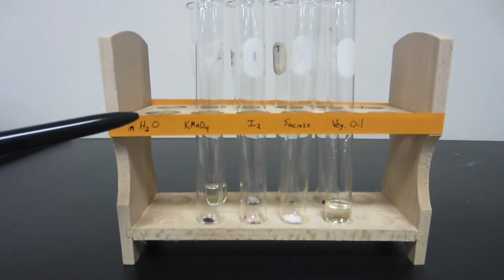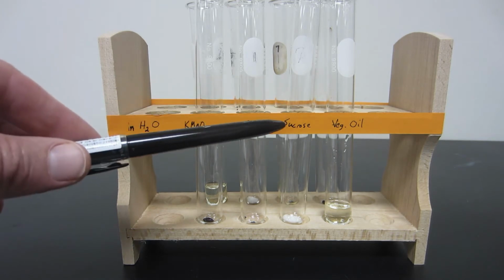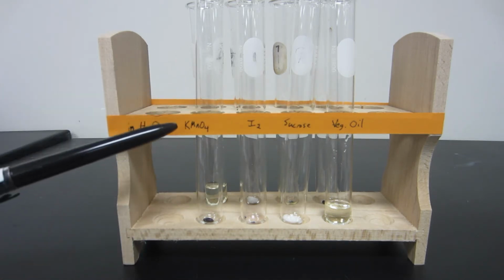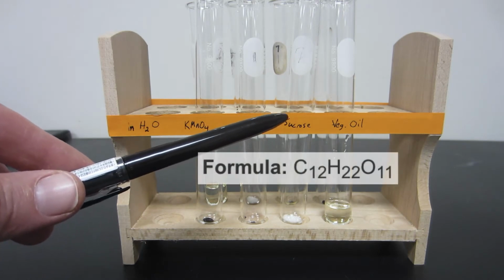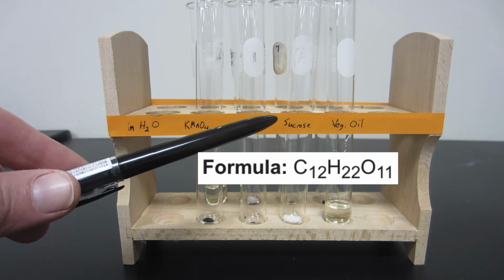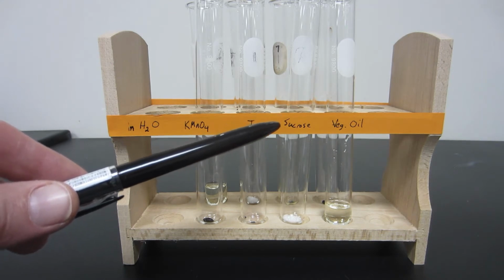Okay, so for the first set, we're going to add water to the different test tubes in just a second, and we'll see which ones will dissolve. So you can see potassium permanganate, iodine, sucrose, and vegetable oil. The molecular formulas for potassium permanganate and iodine, of course, are listed. The molecular formula for sucrose is C12H22O11.